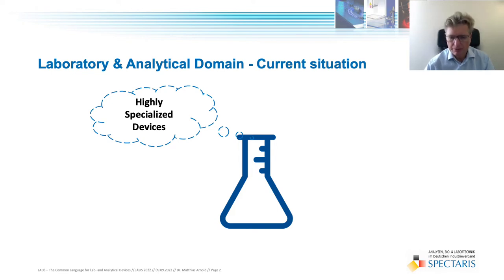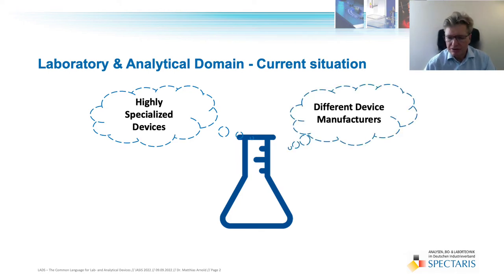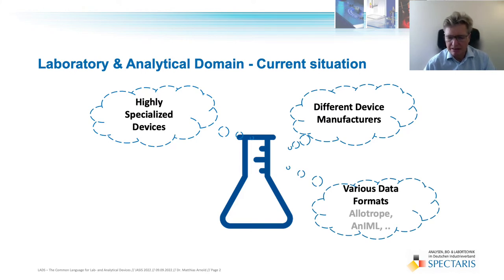In a typical lab, you will find a mixed assortment of highly specialized devices, provided by very different equipment manufacturers. Some of the vendors are highly specialized, some of them with a very broad portfolio. These devices produce data, such as analytical results, in a variety of data formats, ranging from text-based formats like CSV to XLS, PDFs, and very often vendor-specific closed formats.